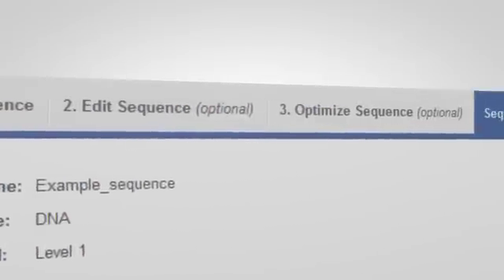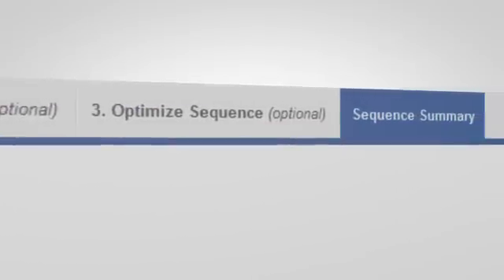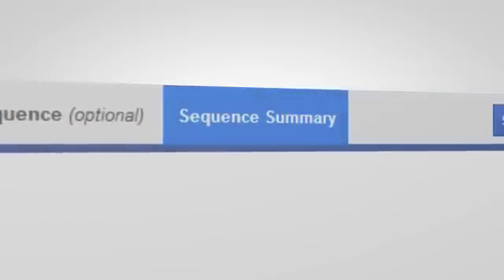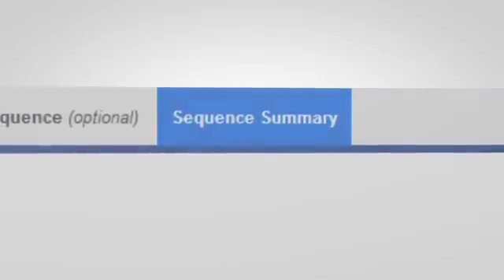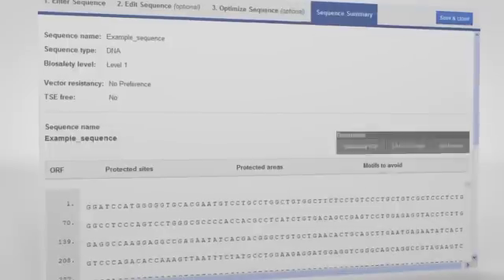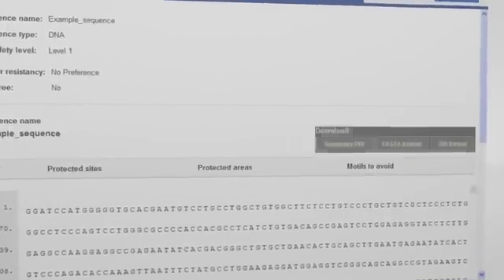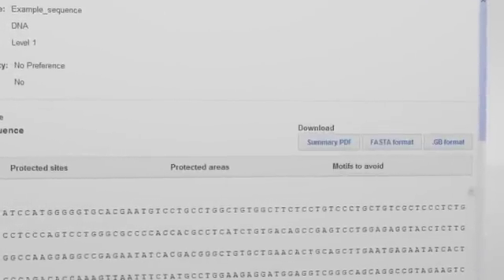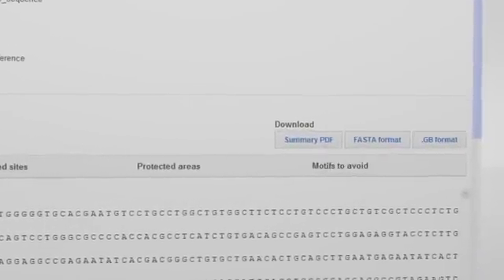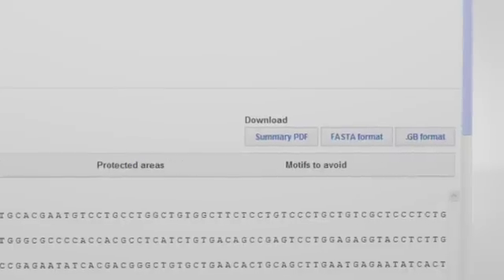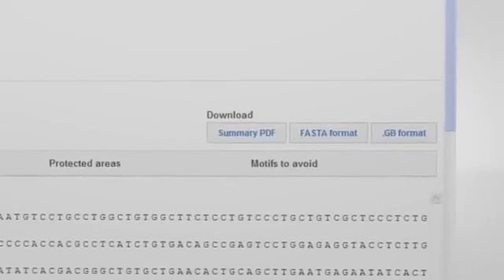At any time you can check your sequence in the Sequence Summary tab. Here you can also download the sequence in different formats, as well as a printable PDF version of the Sequence Summary.